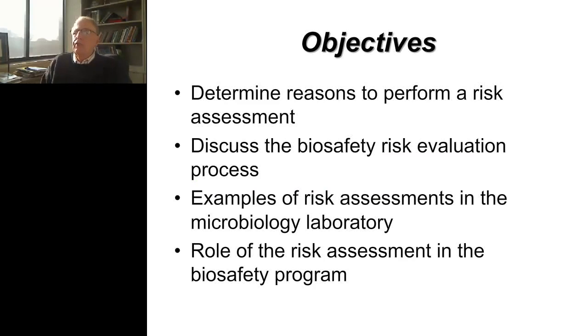So our objectives today are to determine the reasons to perform a risk assessment, to discuss the biosafety risk evaluation process, provide you some examples of risk assessments in the microbiology lab, and look at the role of the risk assessment in the biosafety program in total.